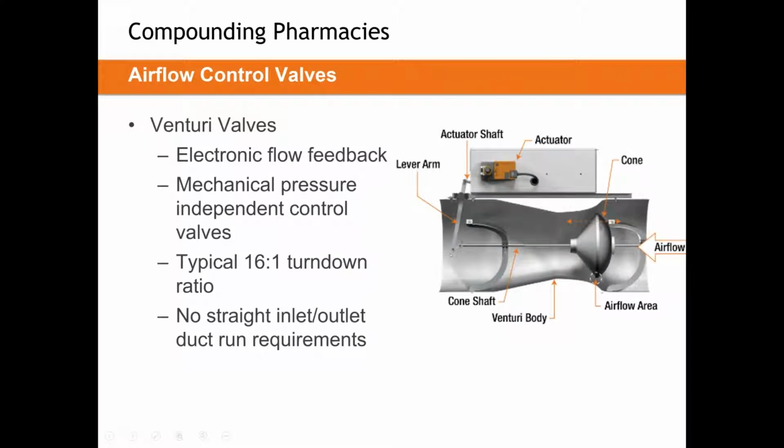So for a biological safety cabinet, we could mechanically set this linkage in place to provide 500 CFM, independently of system pressure. This means we can provide the lowest cost option for that cabinet because there are no controls, no actuators, and no networking required for this device. This is by far the most cost-effective way to control a biological safety cabinet, but it also provides you the least control over that cabinet.